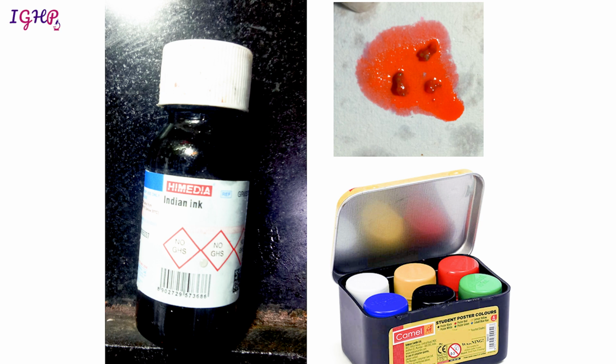Now for the larger specimens which are removed en masse, like a soft tissue tumor where the entire tumor nodule is sent to you, it is advisable that you ink the entire outer surface. The entire outer surface has to be painted black with India ink. If you are getting an ellipse of skin, or a WLE, wide local excision specimen, then it is advisable that you ink the base of the specimen. And if you have the lateral resected margin, you ink the closest margin that is visible to you.